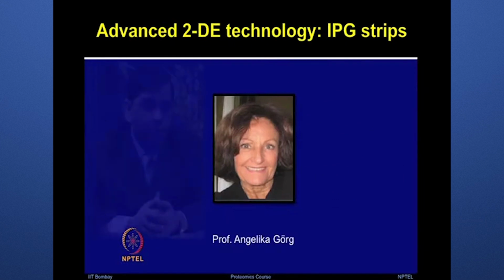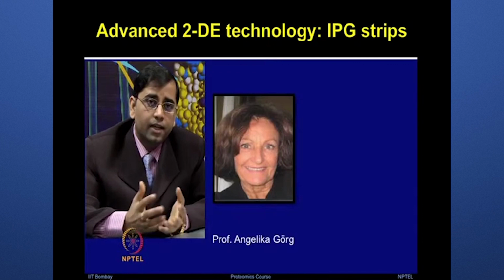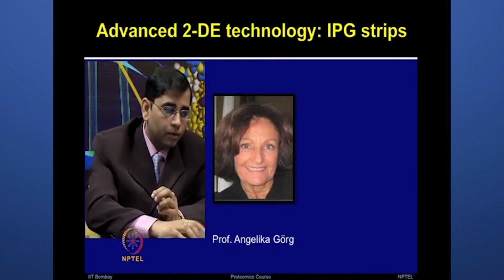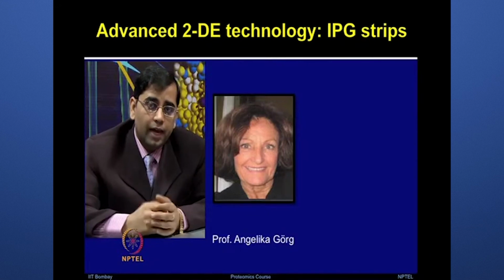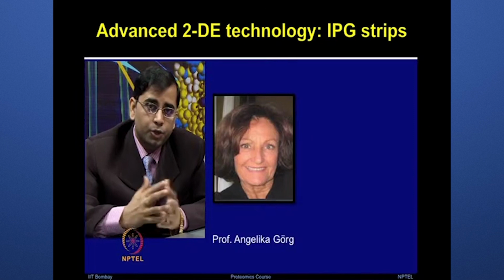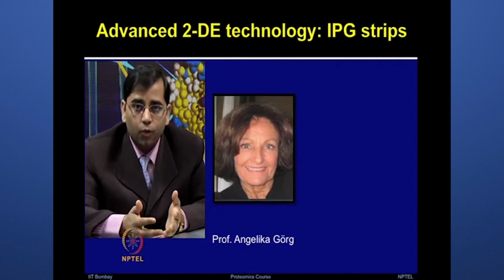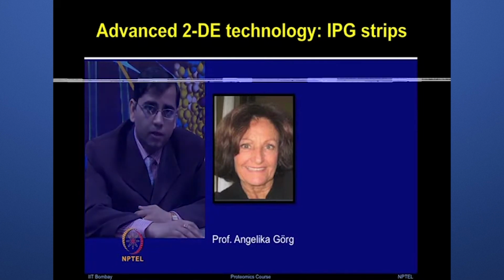Now, I am introducing you to scientist Professor Angelika Görg, who made a significant contribution to the development of the IPG strip. It was her pioneering work in the 1990s which eliminated a lot of criticism which people were showing due to the reproducibility of gel to gel, and along with the IPG strip, several other advancements occurred in the field which helped to make this technology more reproducible.